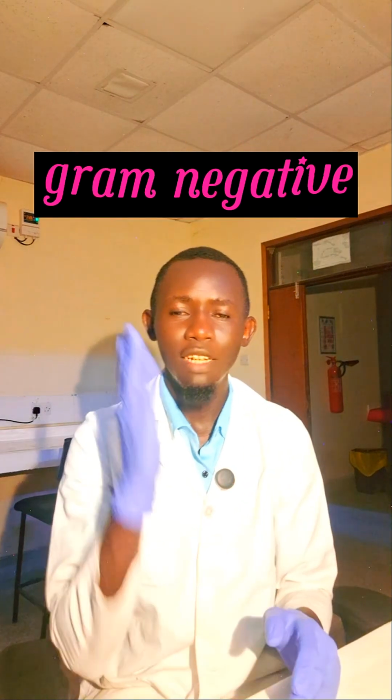So gram staining is just a basic technique used in the laboratory to differentiate between two groups of bacteria. I'm talking about gram negative and gram positive bacteria. So they differentiate these two organisms based on their color change, that is the pink in color and the purple in color. So gram positive bacteria, they're able to obtain that purple color, and gram negative bacteria, they're able to get that counter stain that is red in color to produce that pink in color.